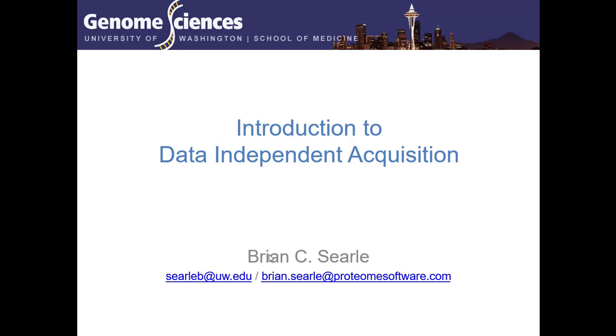I figured I'd break this day up into a bunch of sections. The first section, this first hour, we're going to talk about some introduction to DIA, and then secondly, we'll talk about how to do it, and particularly how to interpret data in Skyline. And then at the end, we're going to talk about how to infer detections directly from DIA data using a program called Pecan that we've been working on.